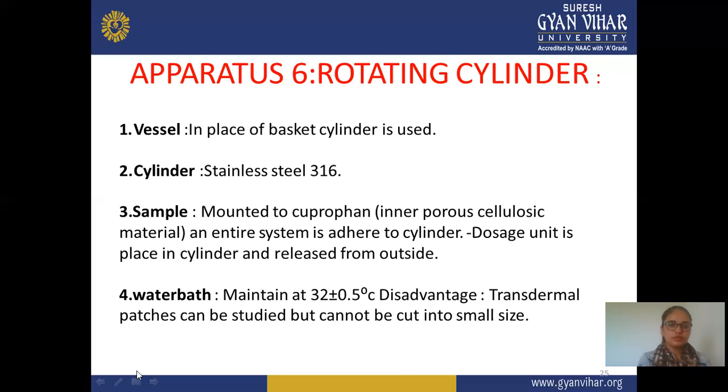And fourth is the water bath. In the water bath, maintain a temperature of 32 degrees Celsius, plus minus 0.5 degrees Celsius. Means type 5 and type 6 require 32 degrees Celsius temperature. The remaining ones require 37. But in 5 and 6, you maintain 32 degrees Celsius temperature for the water bath.